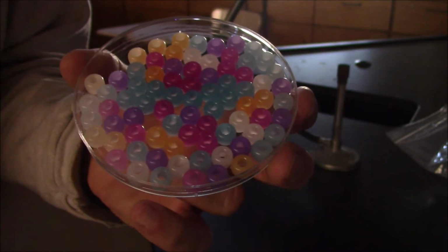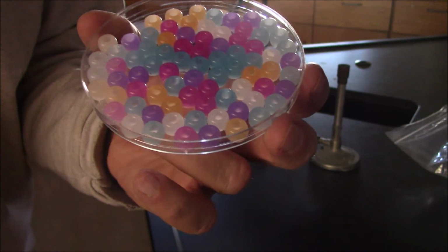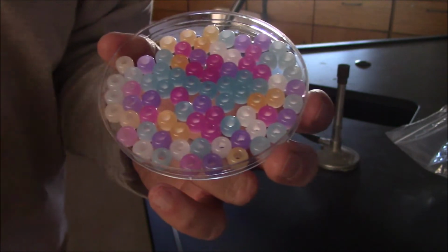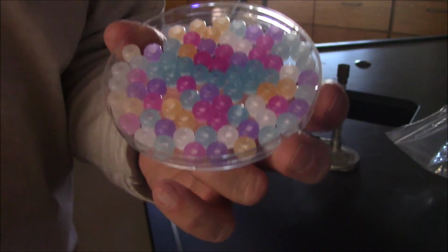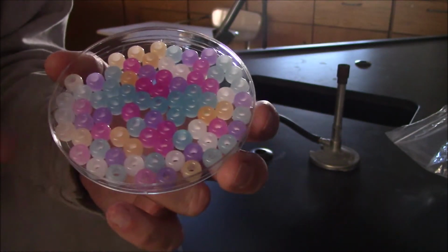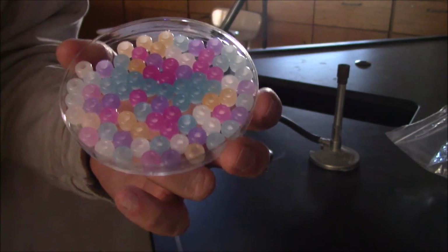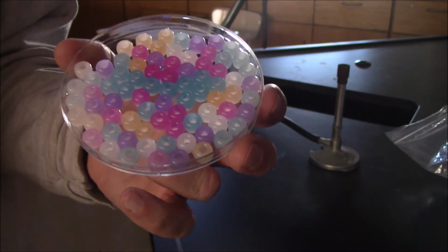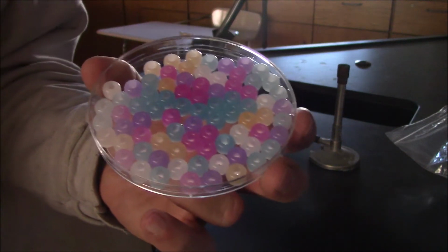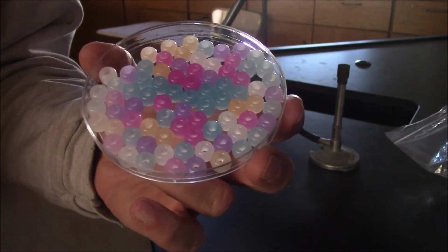And what's happening is the beads have absorbed the UV light, which has a shorter wavelength, a higher frequency, and a greater energy, and then they're emitting visible light. So they're absorbing light of one energy and emitting light of another. And when the light's all been emitted, the energy's kind of given back, and they'll return to their whitish color. So you can see some of the beads are turning. Now, these beads just come in a pile with a bunch of different chemicals.